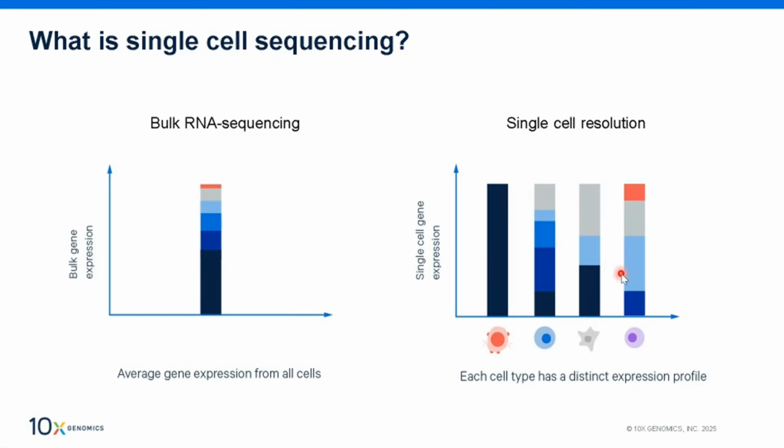However, by using the traditional method, we will extract RNA from all these types of cells. Then all these expression profiles, instead of looking at them individually based on their cell type, we average them out and only get one single piece of information. We are treating them the same, like they should have the same expression profile, but in reality, there are differences.